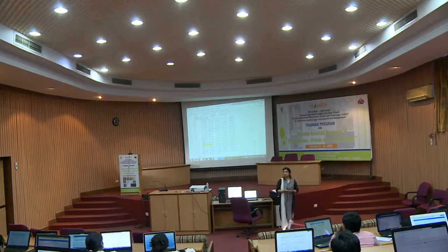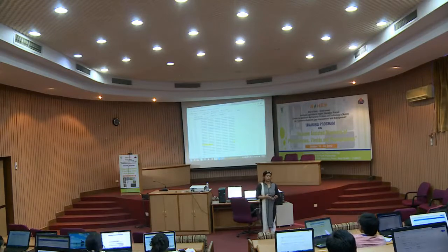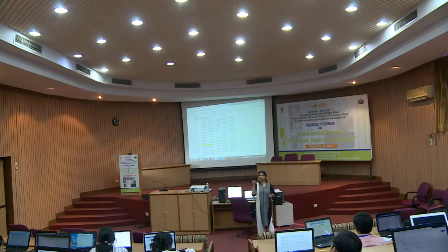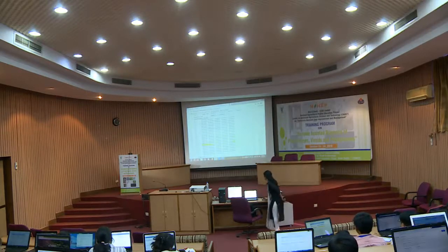One form is which we generally think, okay, the FASTA file, we actually require the FASTA file, the sequence ACGT, whatever it gives. The another thing is AB1 files, the chromatogram files that are directly generated from the instrument. Those are actually the raw files, okay. So, we cannot do manipulation in those files. I will just show you what all are the formats.